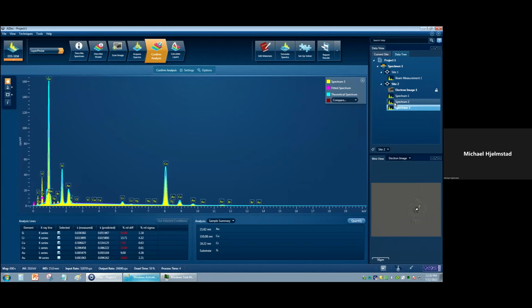A 0 had actually been wiped off the label, and it just shows how poor the lab quality can be. But I can assure you that when we went back to the people that actually worked on this, they said, no, it's actually supposed to be 300 nanometers of copper. So it was a big relief to me, but it at least proved just how far off you can be on your initial guess and get to a consensus answer here.